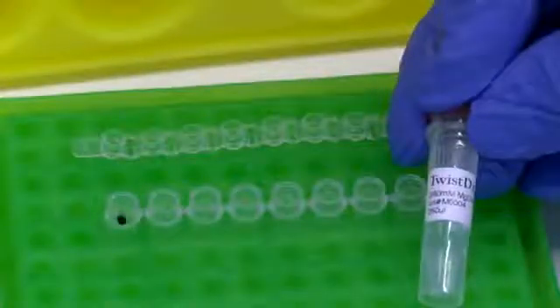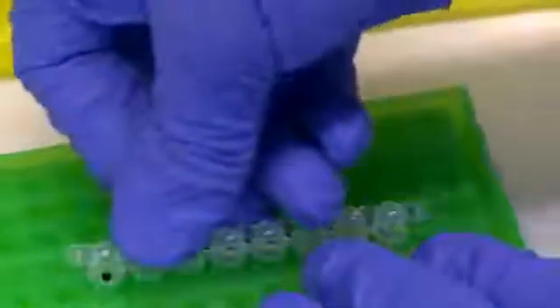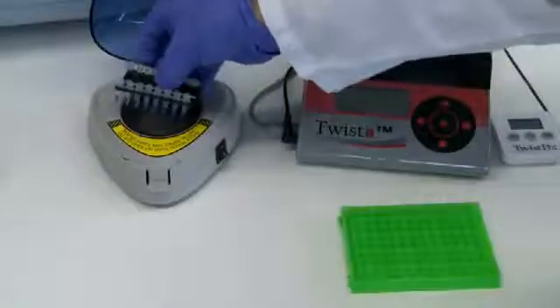Add 2.5 microliters of the magnesium acetate supplied with the kit to the inverted strip caps. Place the caps on the tubes. Centrifuge and place in your heating device.